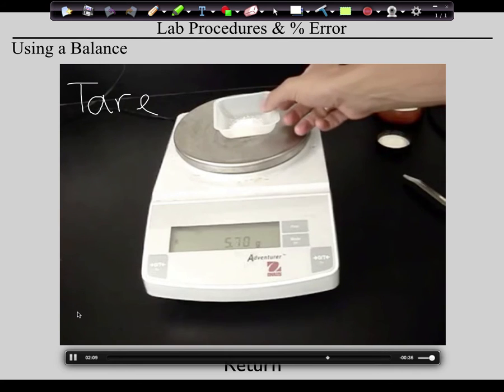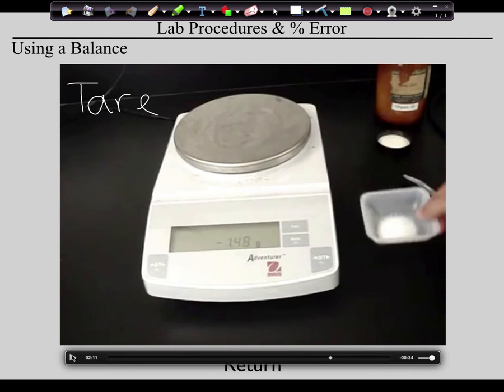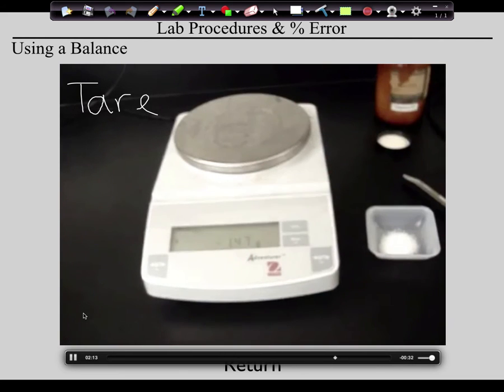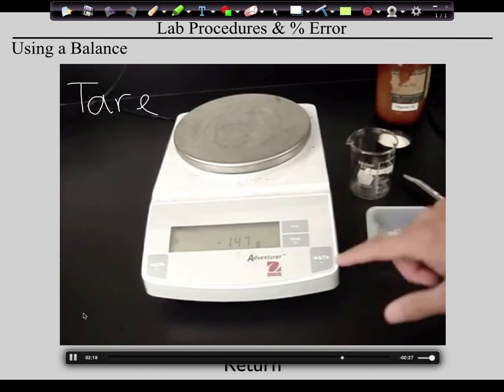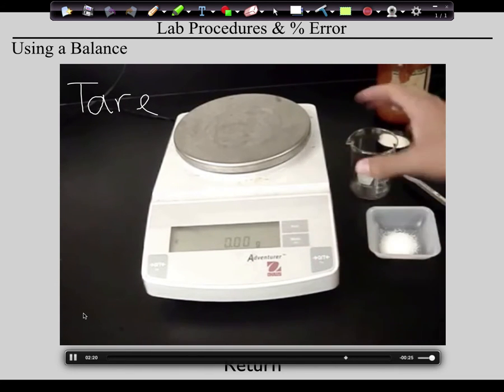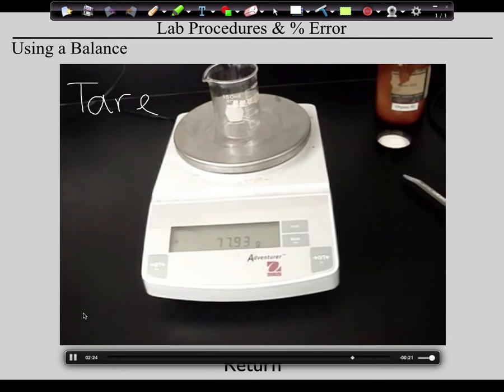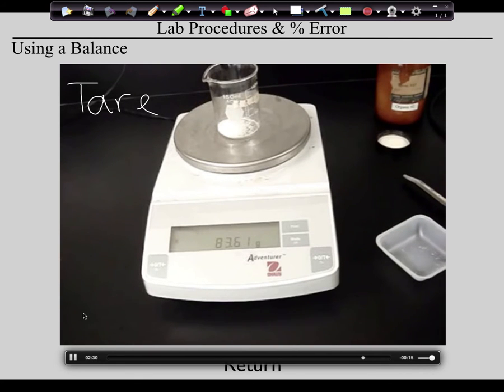So the big thing to remember when you're using the balance is, now guys, listen close here. You want the balance to say zero before you put whatever you're measuring. So if I want to measure the beaker, I want to hit zero first. Now I put the beaker on, and now that's the mass of the beaker. If I pour the sugar in that, since I didn't hit zero, that will be the mass of both the beaker and the sugar.